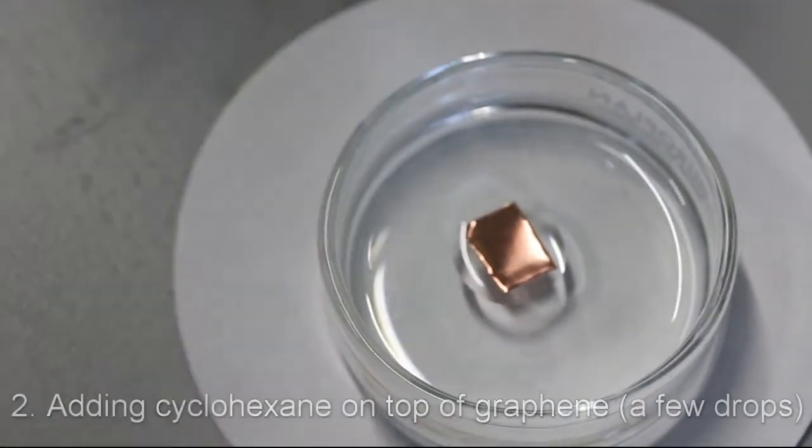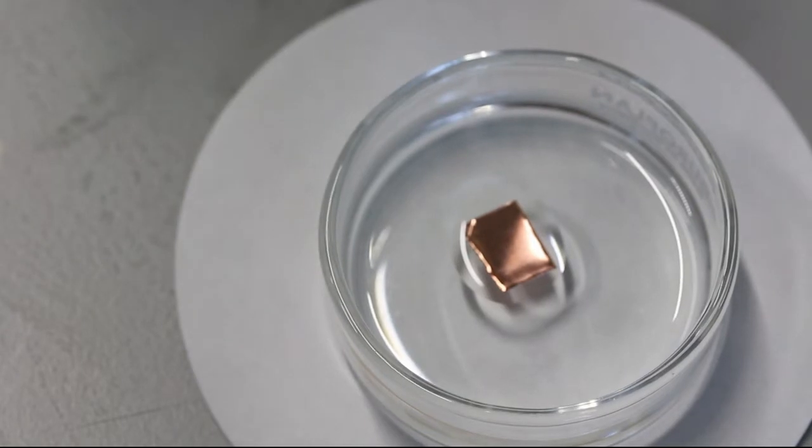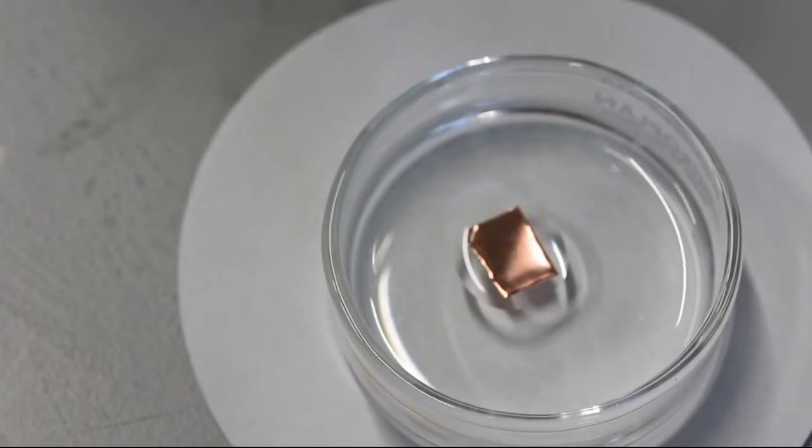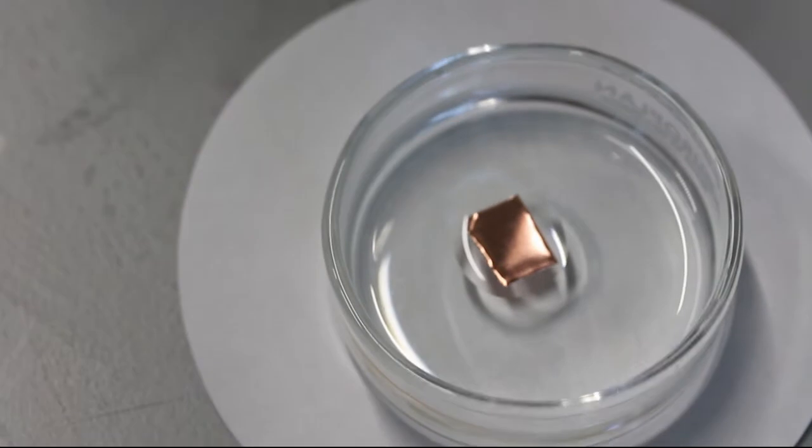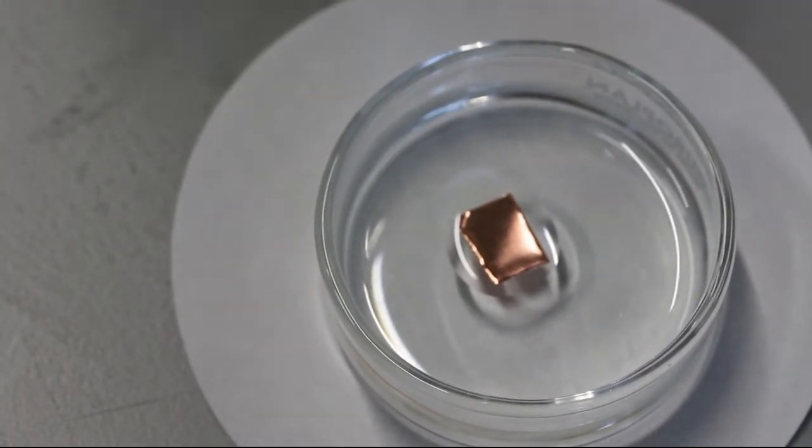The downside of having too little cyclohexane is that it can evaporate before copper is fully etched and leave the graphene unprotected. To preclude that, we can carefully add more cyclohexane after this first layer is frozen.